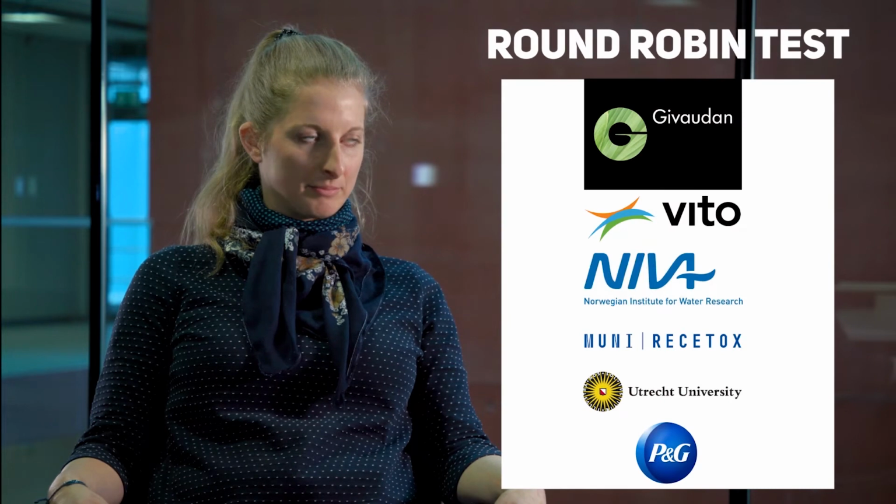So our proof of concept study was really successful, and it was also very well received by the community, but also by industry and regulators. But clearly, I would have asked the same questions. They now ask, well, you're the experts. Can other people do the same? So we started a so-called round-robin study, where we had partners from industry and other research institutions. We trained them, showed them how the method works, and then they took the test to their lab and performed the same test with a set of chemicals.